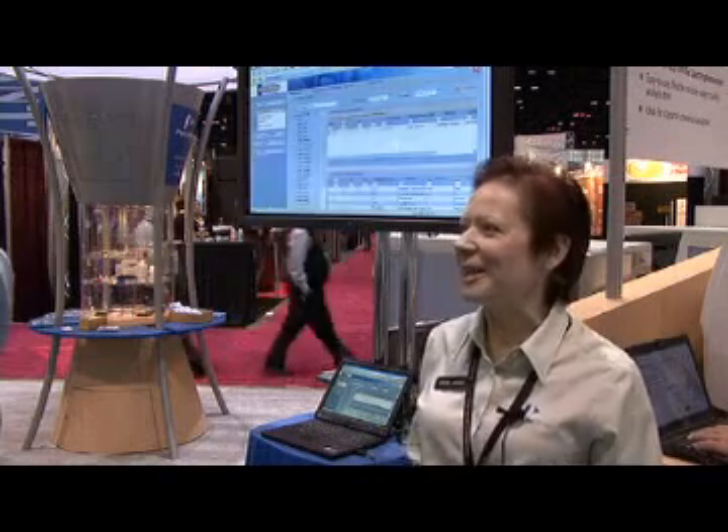What this allows you to do is take your LIMS with you to a meeting, to the airport, any place where you need to get information from your LIMS data but you don't have access to a regular computer. Our new webtop client gives you the data you need to make the decision.